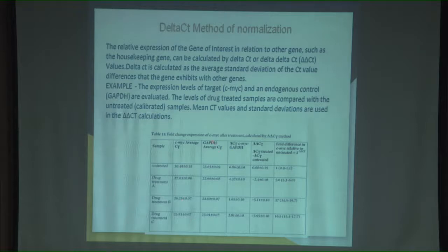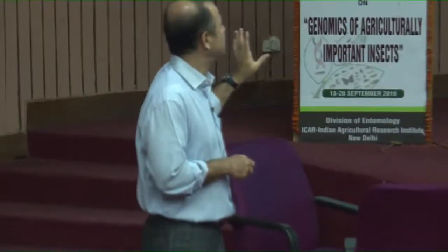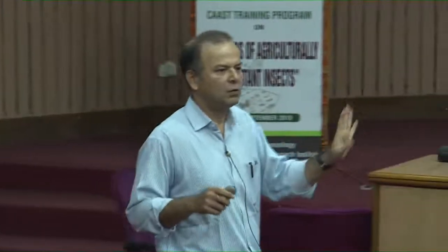I have taken one housekeeping gene, again tube 1, tube 2, tube 3, tube 4. So, total 8 tubes for one technical replicate. If you want to replicate, again another 8 tubes. One more replicate, another 8 tubes, fine. Then you prepare cDNA and run qPCR, and the machine will show the CT value in each tube. You need not do anything.